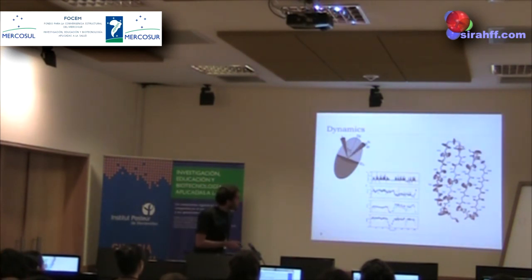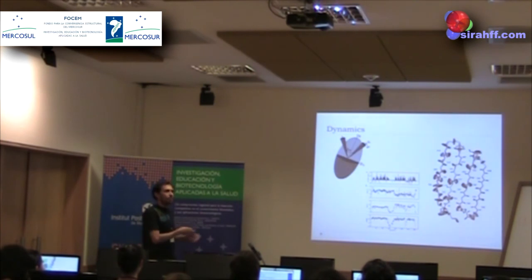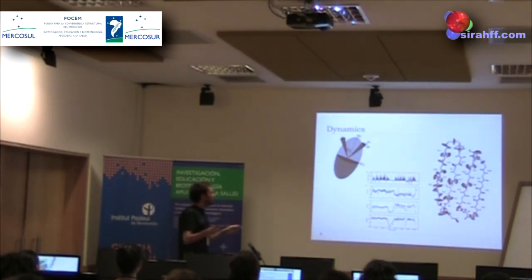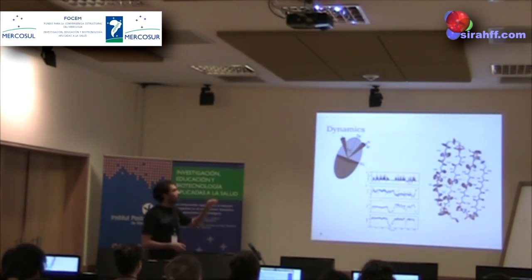My opinion is that it's the technique where you get more detail in a wider time range of dynamic information, from nanosecond time scales to much longer time scales. You have techniques to cover the whole large time scale range where relevant processes take place.